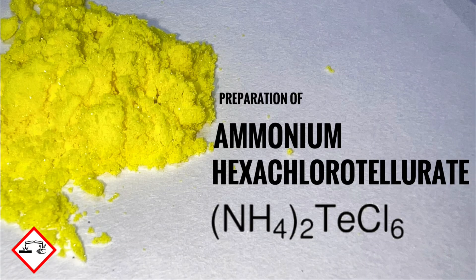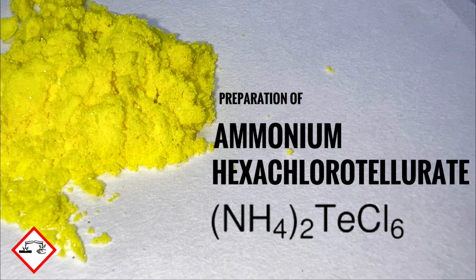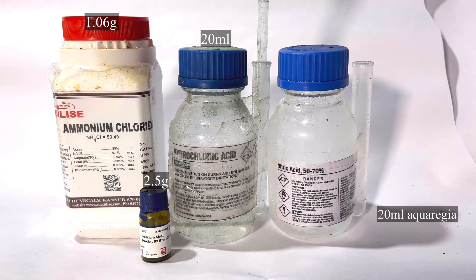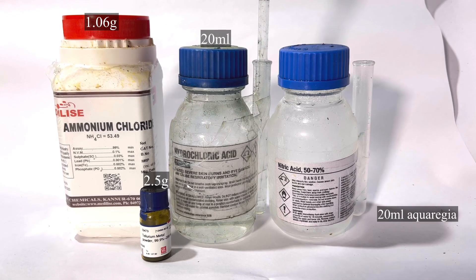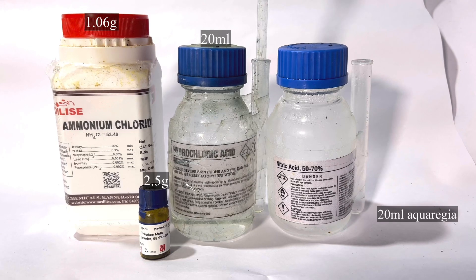Hello friends, in this video we will make ammonium hexachloro tellurate, which is a beautiful colored compound of tellurium. Chemicals required for this preparation are 2.5 grams of tellurium metal, just enough aqua regia to completely react with tellurium.